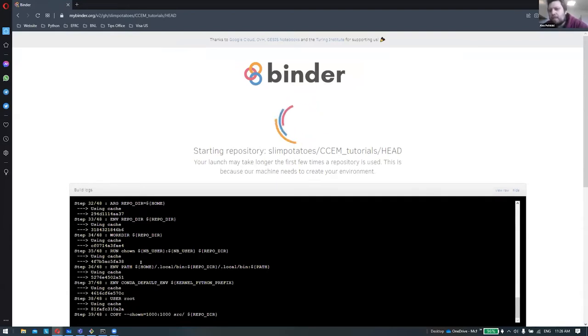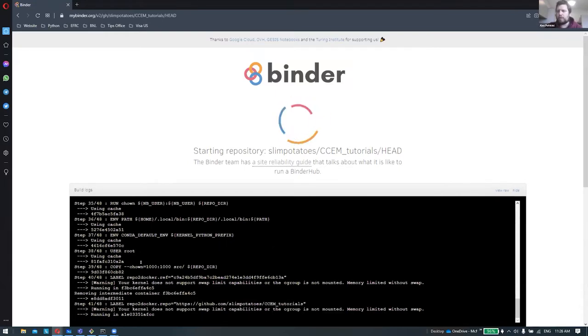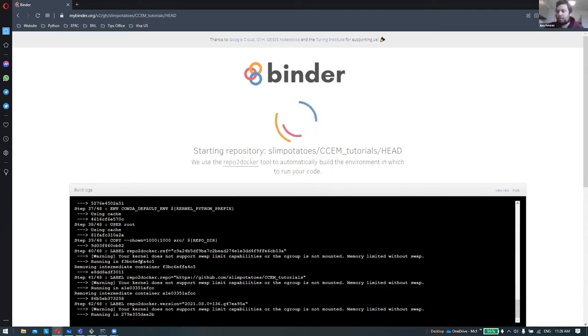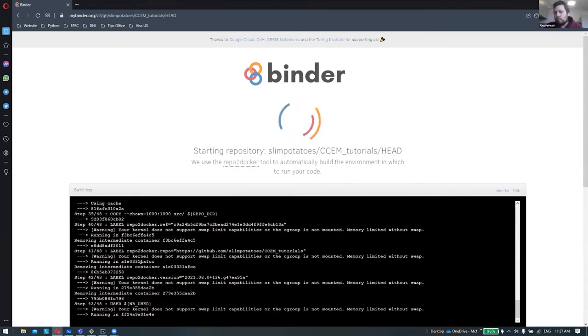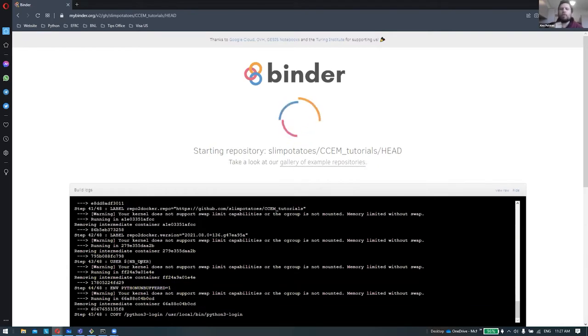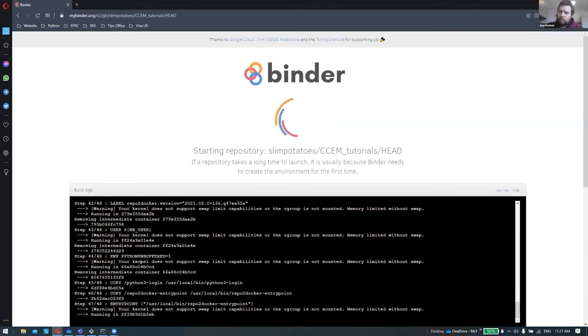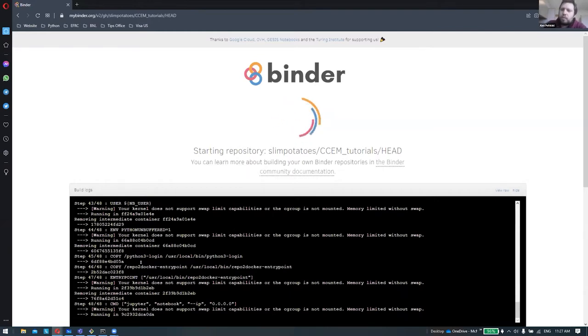Today, on the first tutorial, we looked at how to visualize the data. The idea was that we don't modify anything about the data, we just want to see what is inside. Today, we're gonna do something different where we manipulate the data, change it a little bit for a certain purpose. Here, we want to go to what we mainly call particle counting, particle characterization. This is where you have similar features on your entire image, and you want an automated way of characterizing them: their size, centroid, perimeter, whatever you want. So I have a certain type of data, and I want to modify it in some sense to run it through the packages that already exist for that purpose. That will be the goal of today.